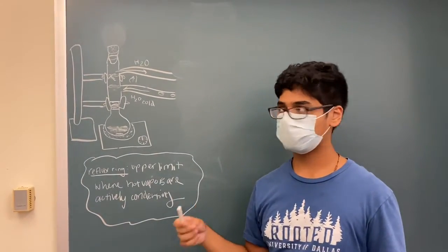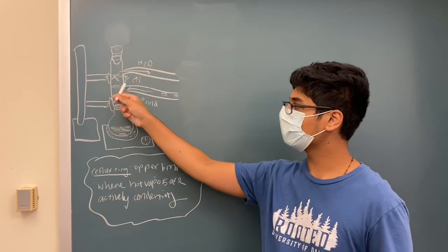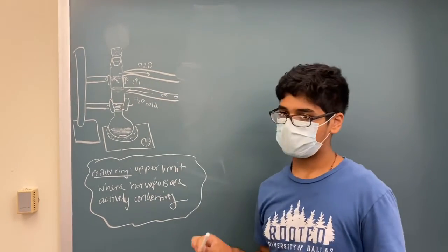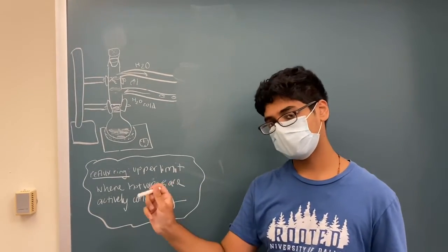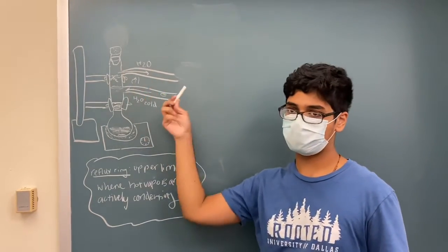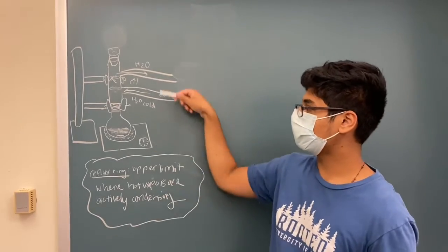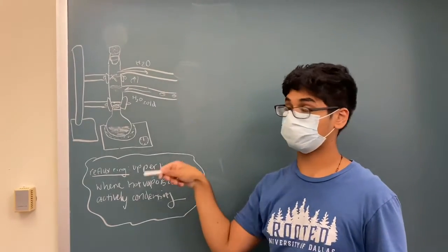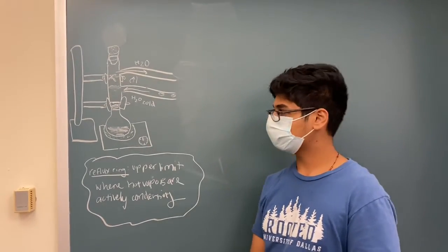Then you're going to attach two rubber hoses. One hose is on the lower arm of the vertical condenser column which is where cold water is going to be entering, and then the upper arm is going to be another hose where water will be leaving. Basically there will be a constant circulation of water throughout the vertical condenser column.